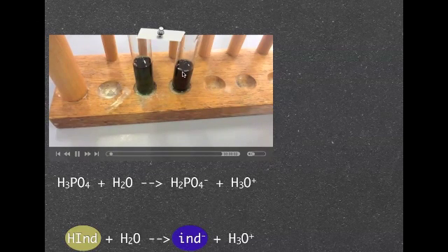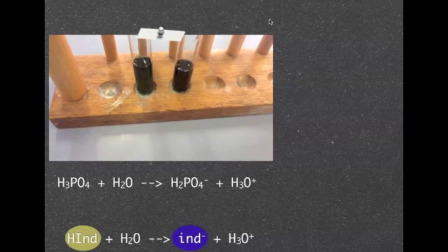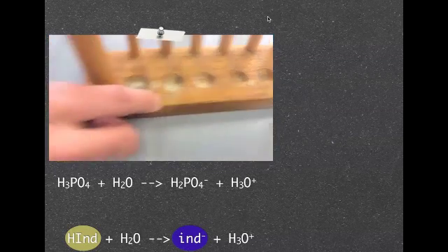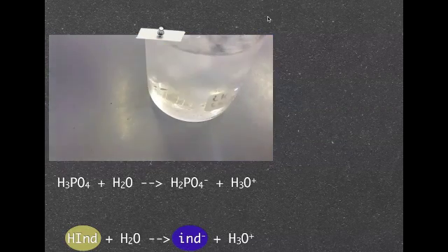Here it is. Obviously I've got my two solutions and I've just put some phosphoric acid and it's got the methyl violet indicator into it.